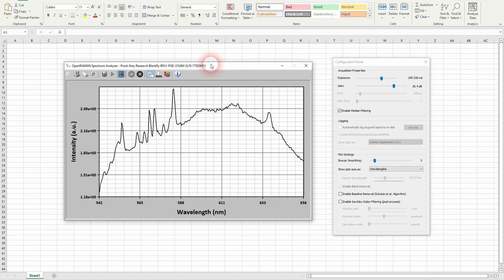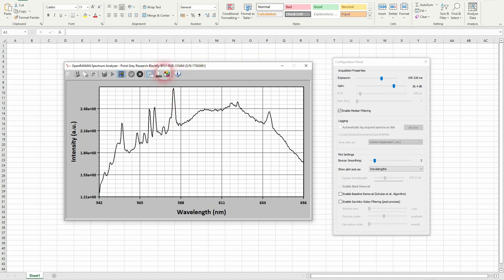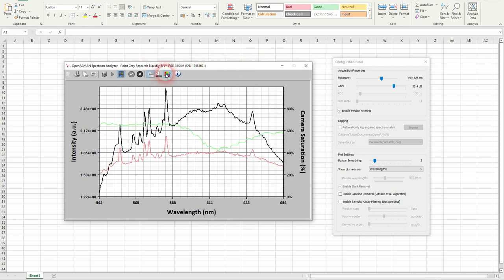So what we currently see is the signal. So now we'll display the saturation and what I want to do is to just try to optimize a little bit.